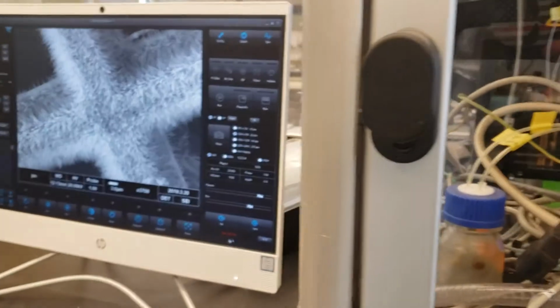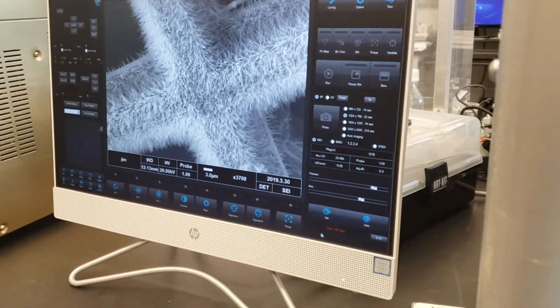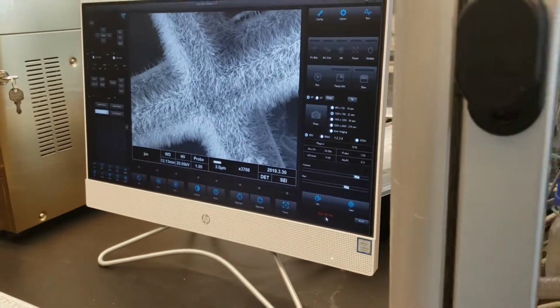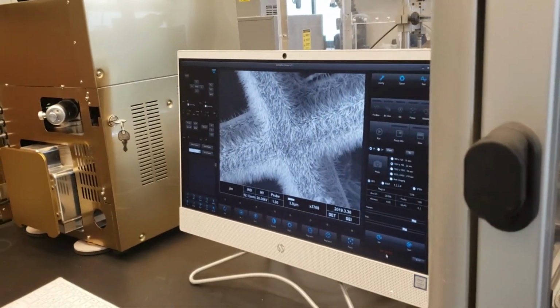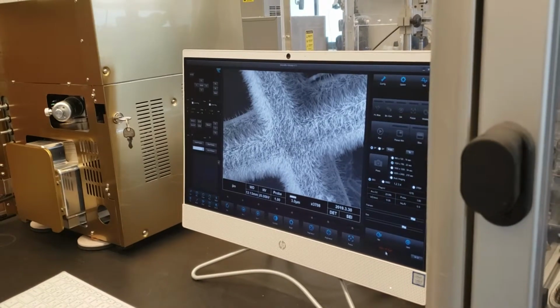It's measuring vacuum over here, right? See where it says gun? And this is going to continuously go down until it reaches its maximum vacuum level of 7.5 times 10 to the minus 5 torr. And it takes about 4 minutes or so to do that.